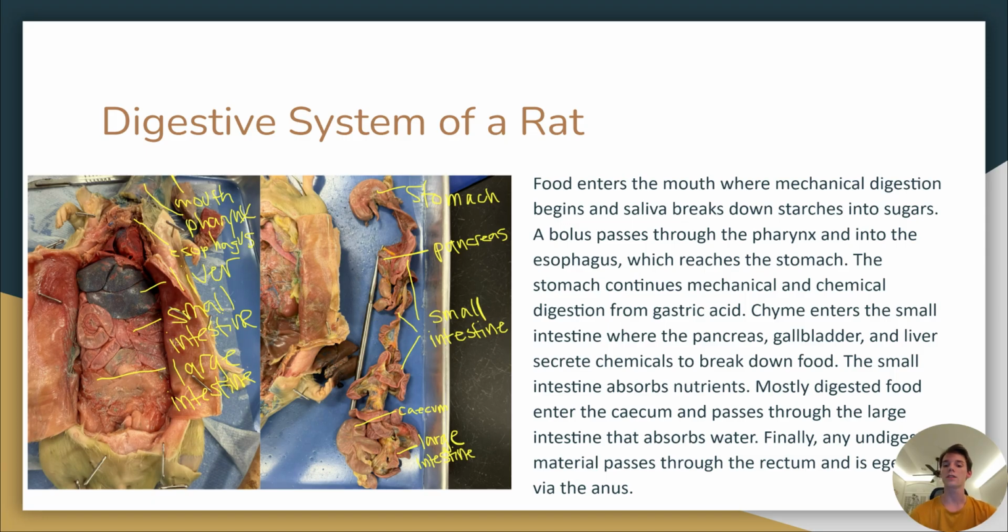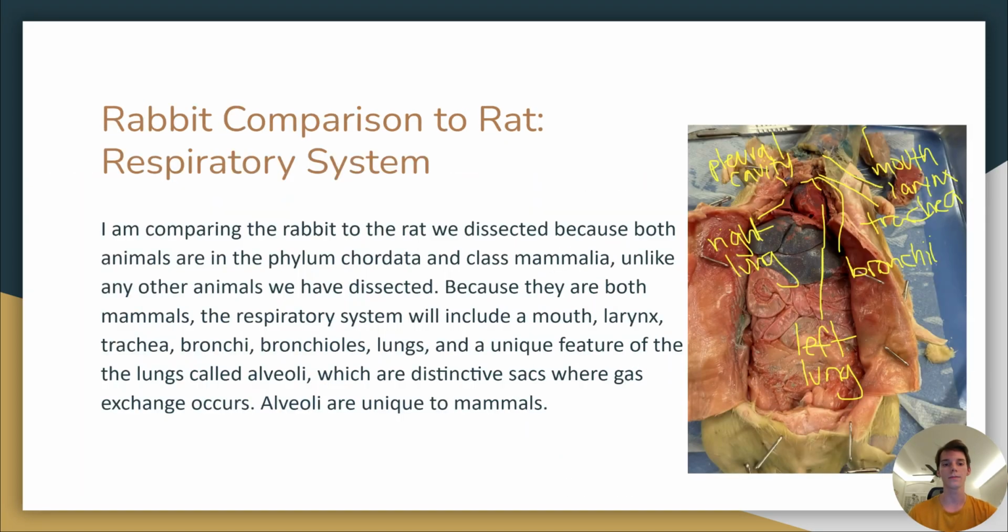And then finally, it enters the cecum and passes through the large intestine so that the large intestine can absorb the water. And then any undigested material is going to pass through the rectum and be expelled via the anus.